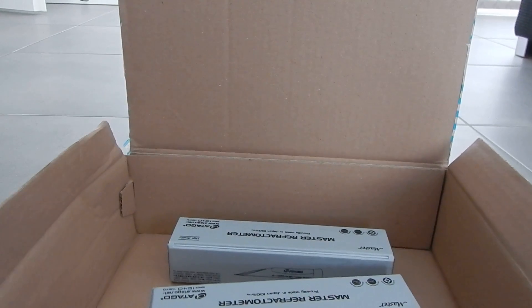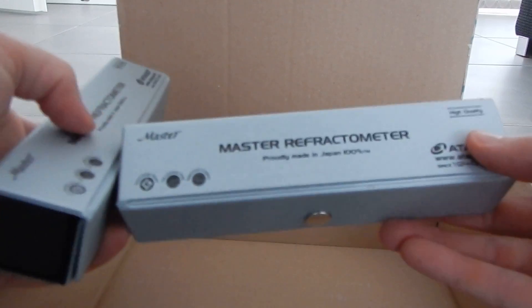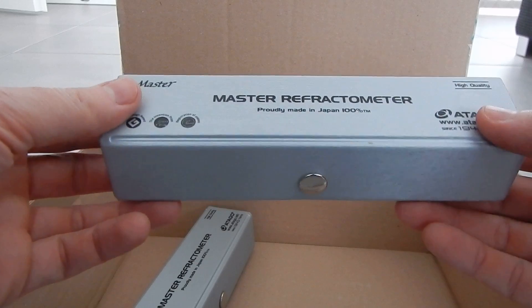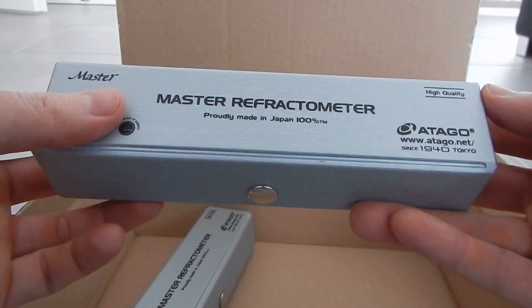So I finally got home and I opened the package. Two master refractometers. It must be made in Japan — 100% TM. High quality. Let's see.